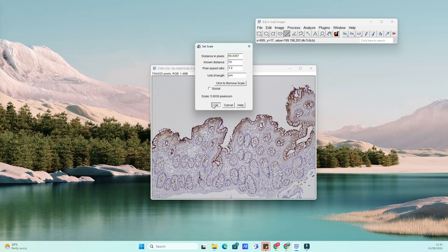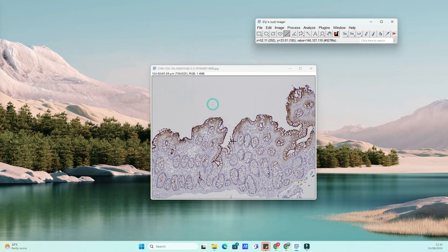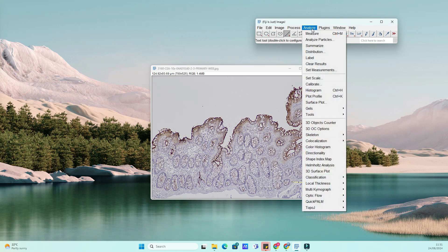A new window will pop up. Here, you'll need to enter the known distance between two points in your image. If your image already has a known measurement, like a ruler or a reference object, you can measure this distance using the Line tool. Once you've drawn the line, ImageJ will show the length in pixels.